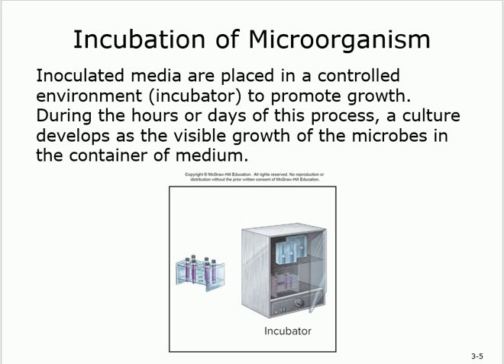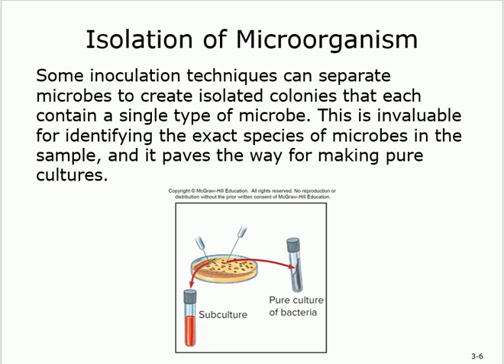I did the incubation. So the most important thing to remember about incubation is controlled temperature and nutrient factors. This is the most important thing. The incubator allows the growth of the organism, with growth factors and controlled temperature. This is what we need to understand here in the incubation. So you're done with the incubation: you put a controlled temperature, you put the medium, it's growing, you looked at it, and it looks okay now.